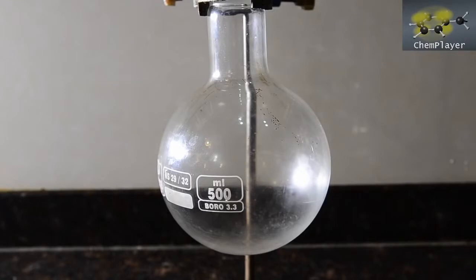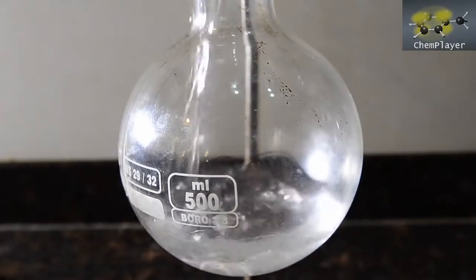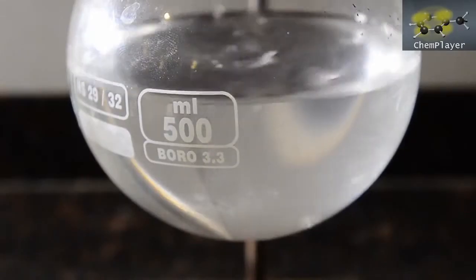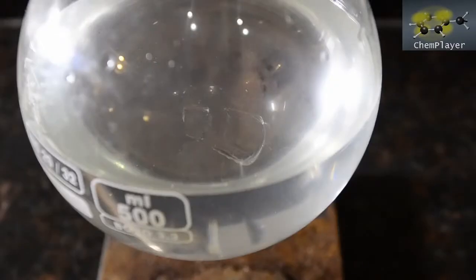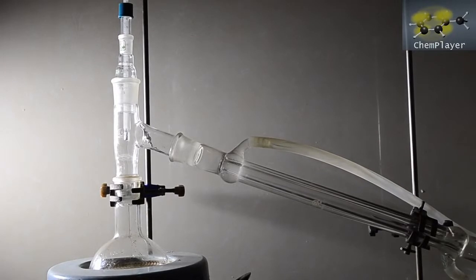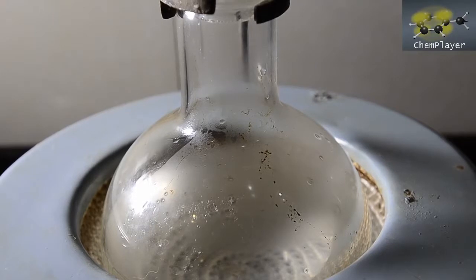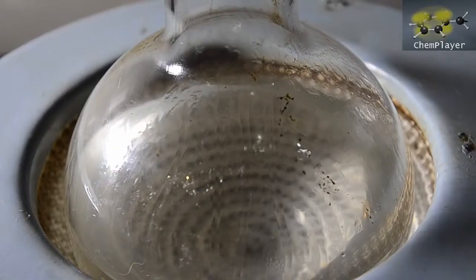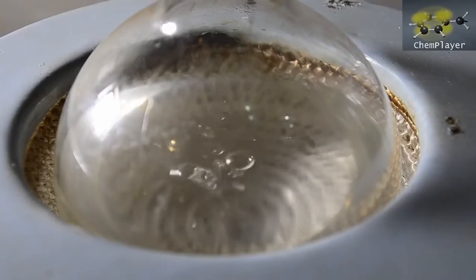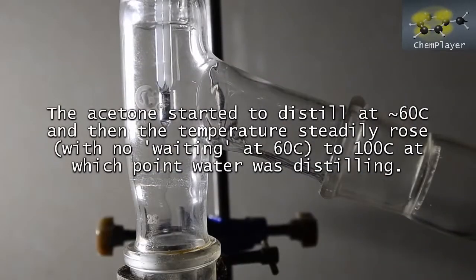So here's a big flask and the mixture. We also added some broken glass to stop bumping. So let's distill the mixture and see what we get. On heating, we first get some acetone boiling off at a low temperature. Interestingly, although acetone doesn't form an azeotrope with water, we've got a vapor temperature starting at about 60 degrees and steadily rising to 100.